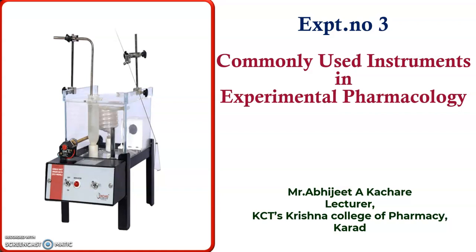In the previous experiment, that is experiment number 2, we already discussed the different laboratory animals used in experimental pharmacology for drug evaluation, bioassay, or screening of different animal models with the help of different drugs. Now in this experiment, what are the different common instruments used for practical pharmacology or experimental pharmacology? Let us discuss one by one in this video.